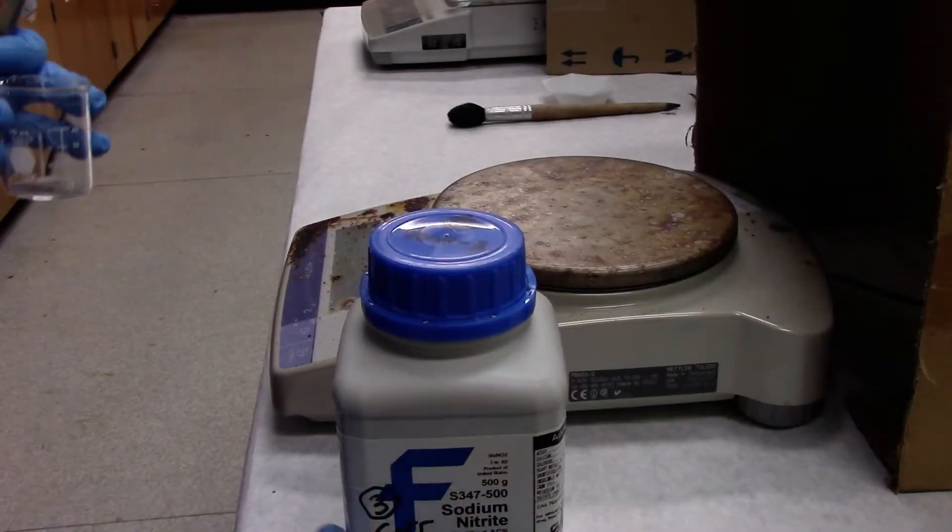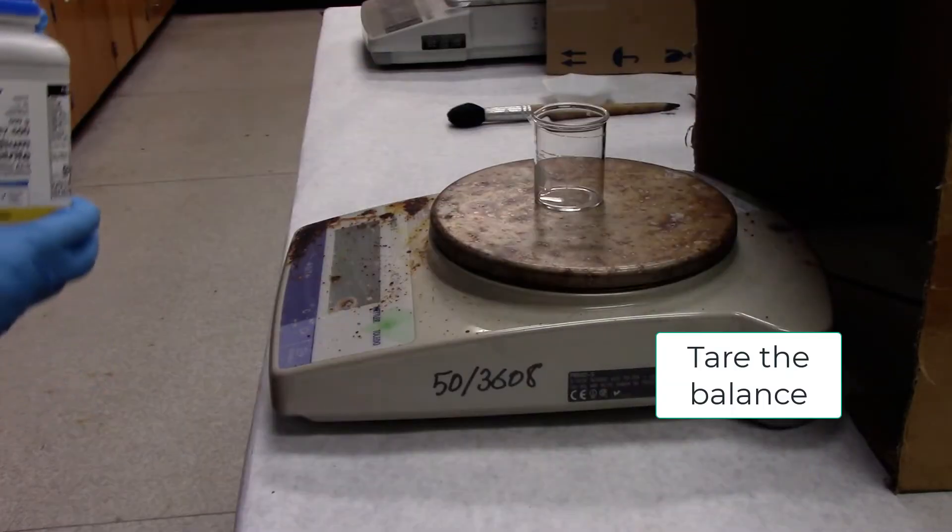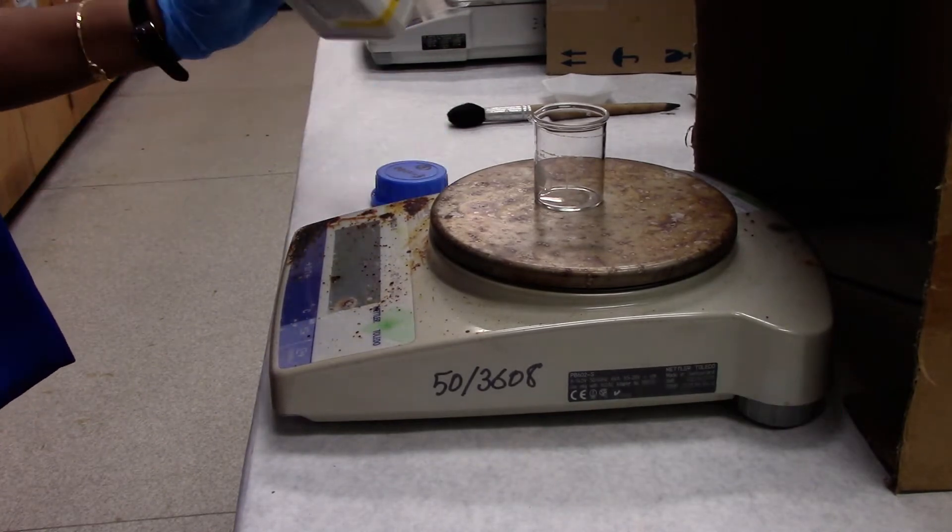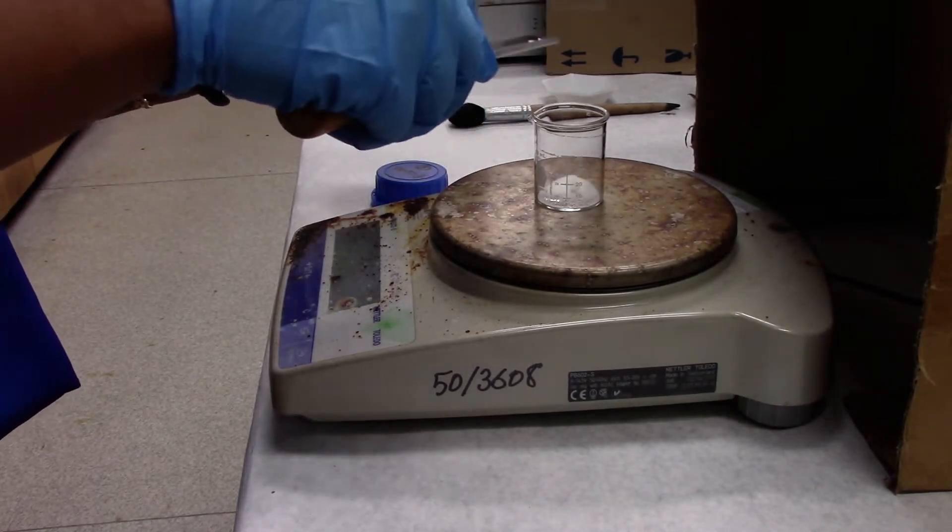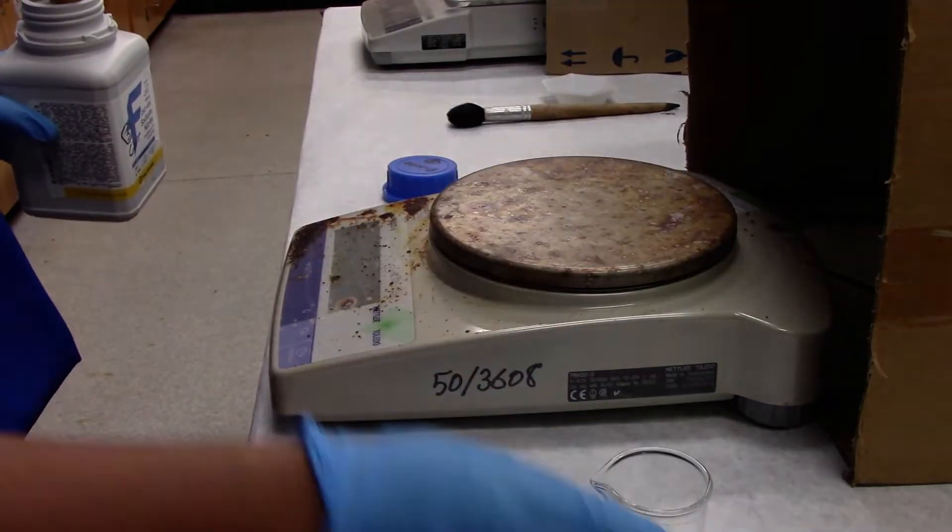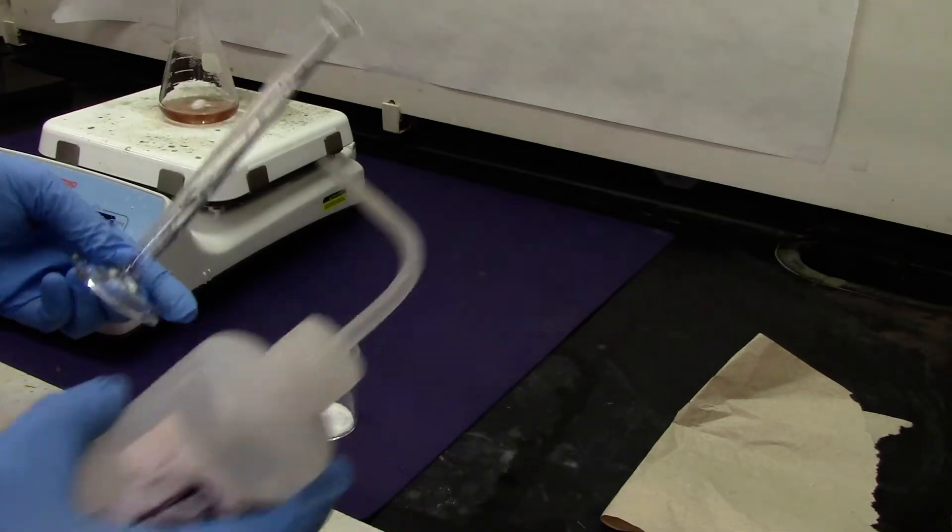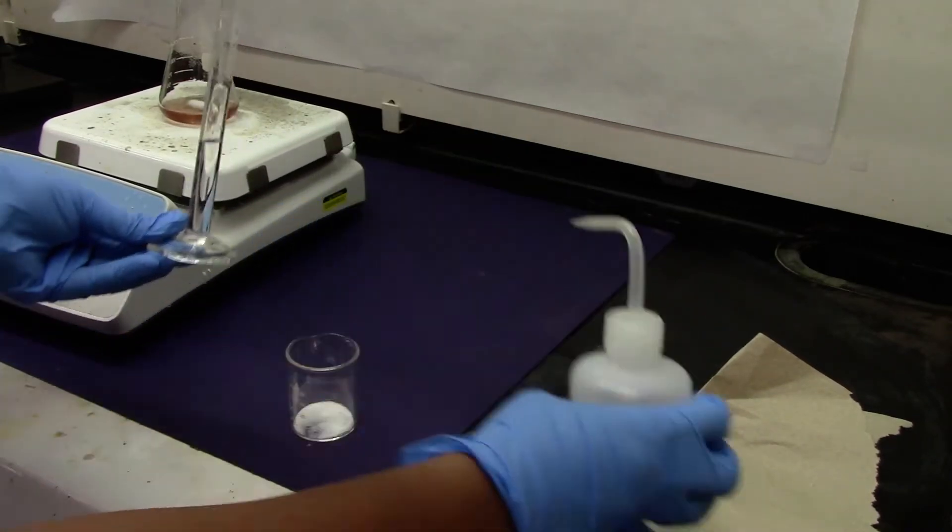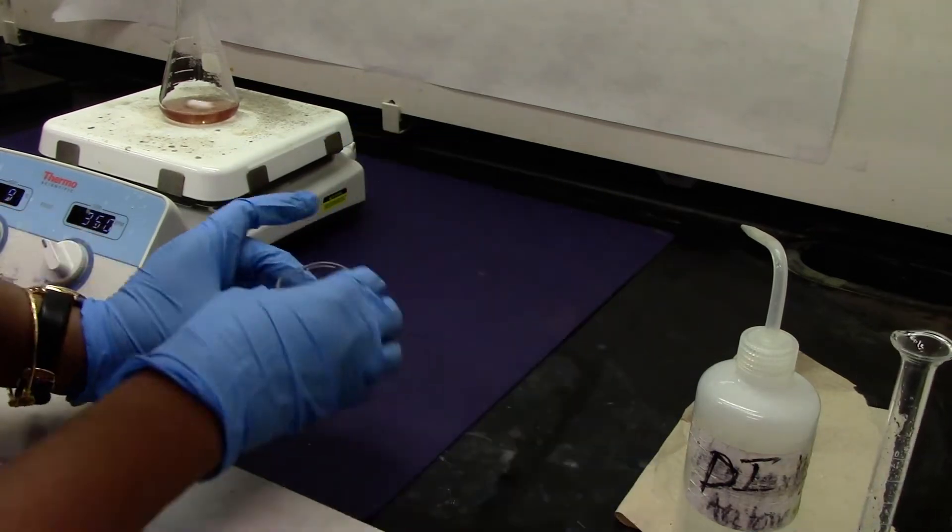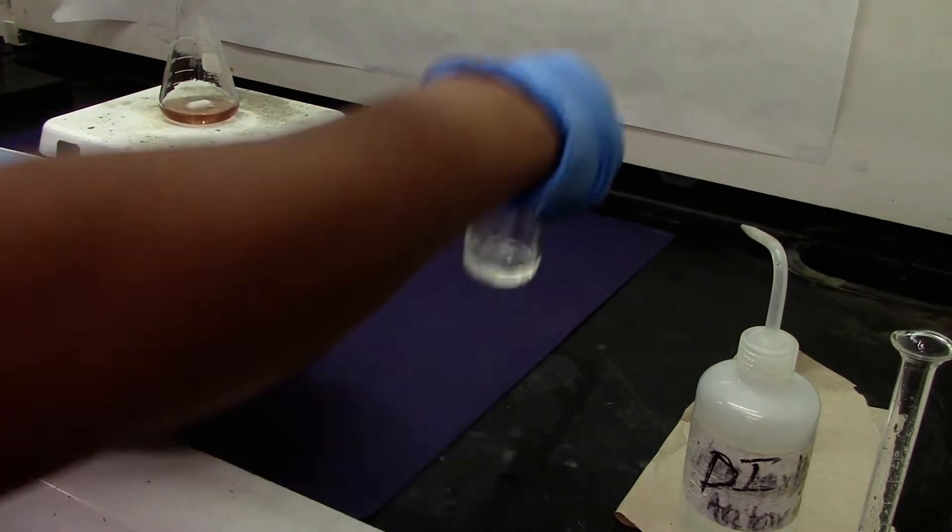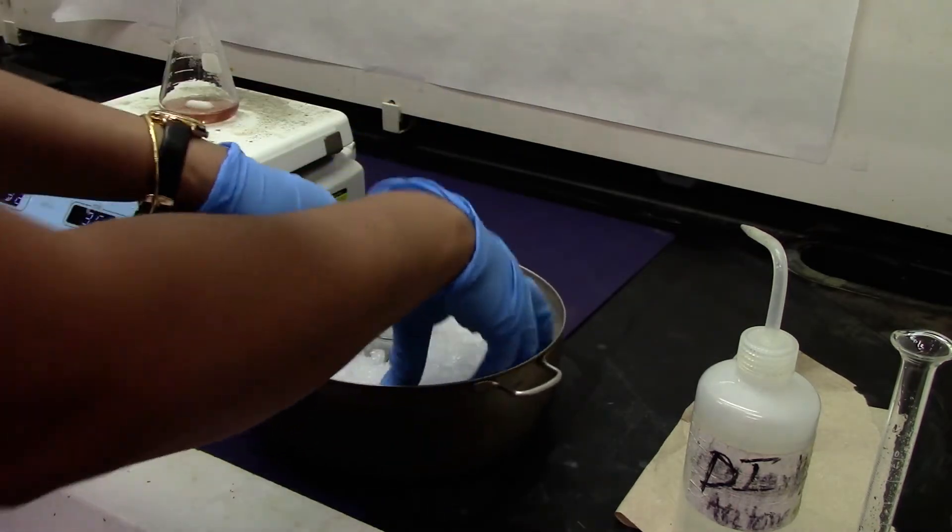We will be weighing sodium nitrite. One gram of sodium nitrite. To the sodium nitrite I'm going to add 5 mL of DI water, swirl it to make a solution, and place it in an ice bath to cool down.